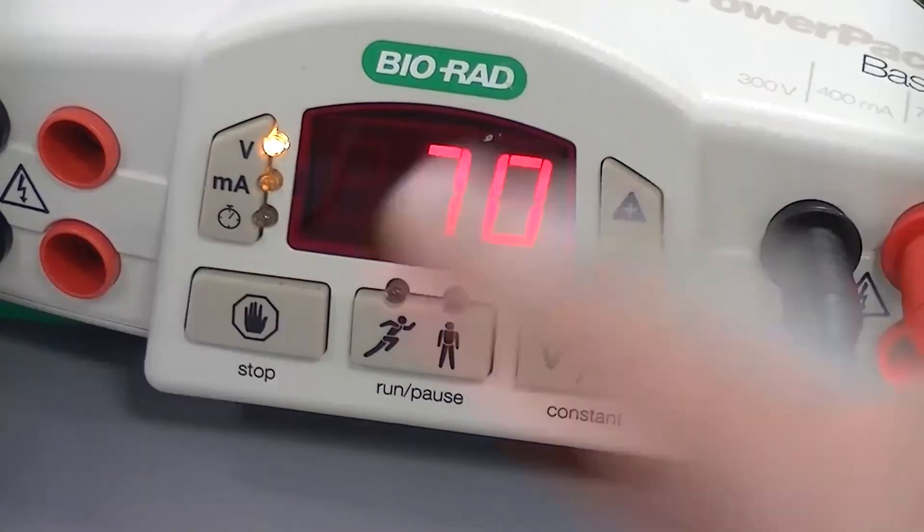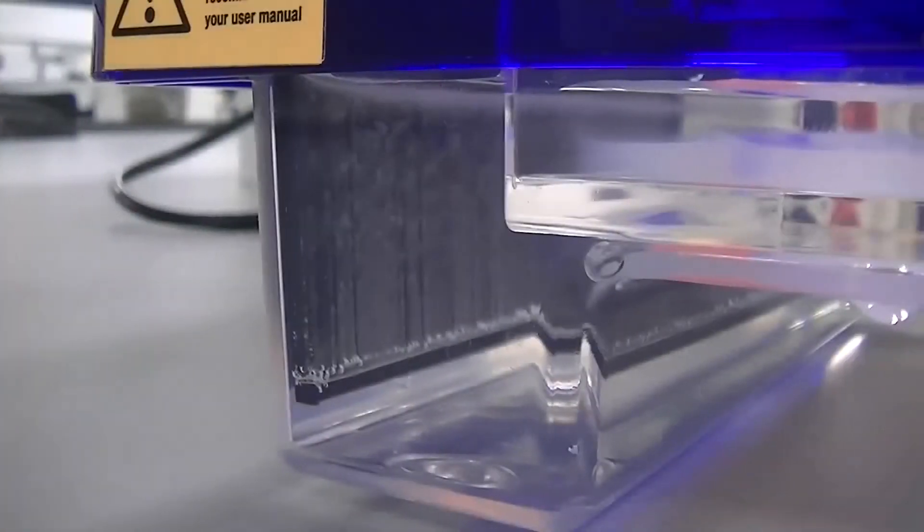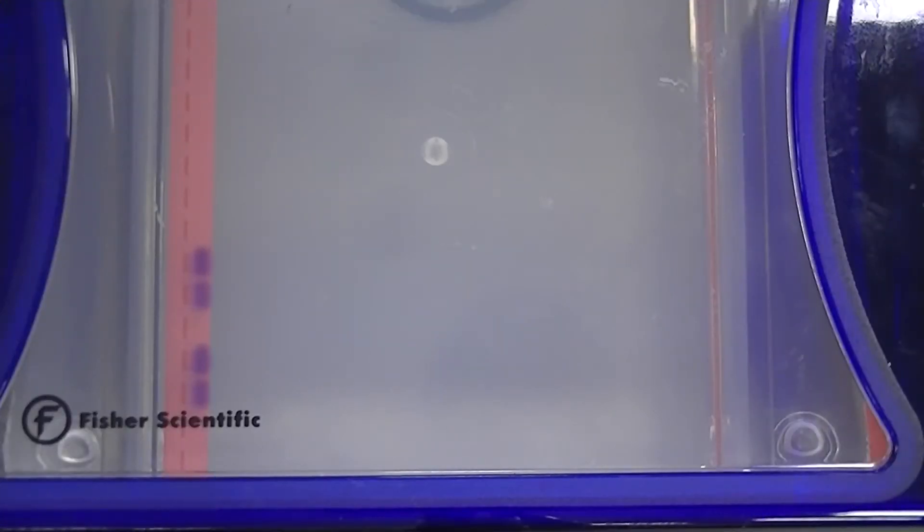Electrolysis is taking place when bubbles are forming. The agarose gel is like a matrix. DNA gets pulled through it by an electrical current. Smaller DNA fragments can travel further and faster through the gel compared to the larger DNA fragments.